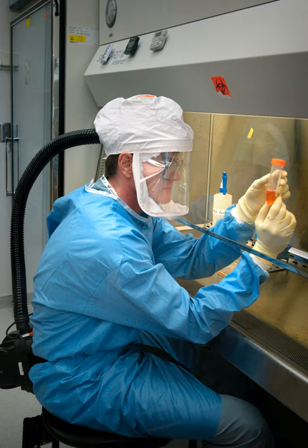Each type's requirements are defined by NSF International Standard 49, which in 2002 reclassified A/B3 cabinets, classified under the latter type if connected to an exhaust duct, as type A2, and added the type C1 in the 2016 standard. About 90% of all biosafety cabinets installed are type A2 cabinets.